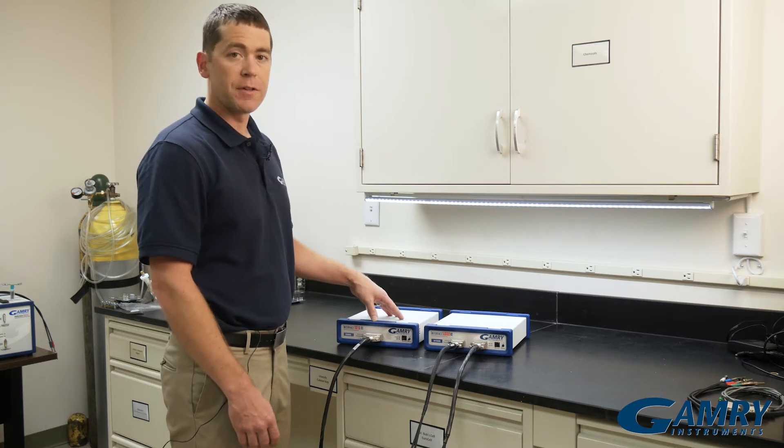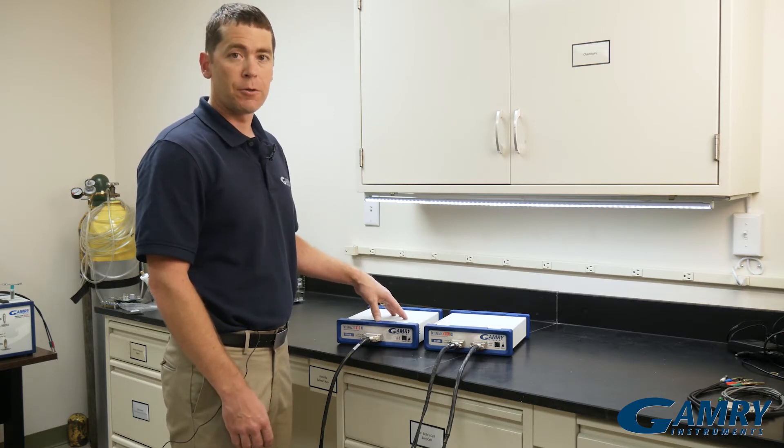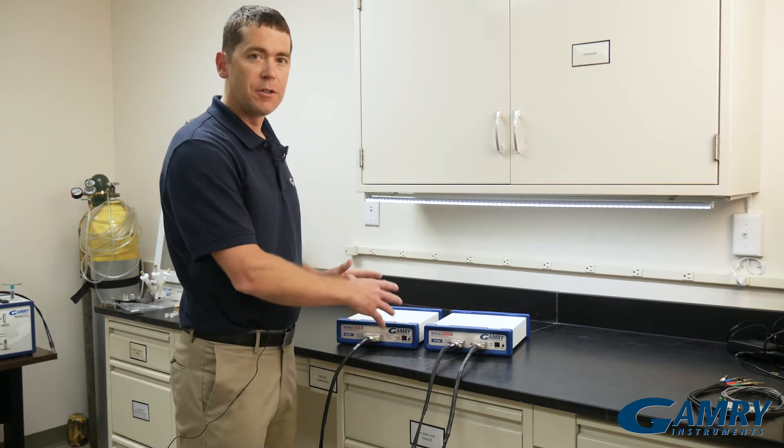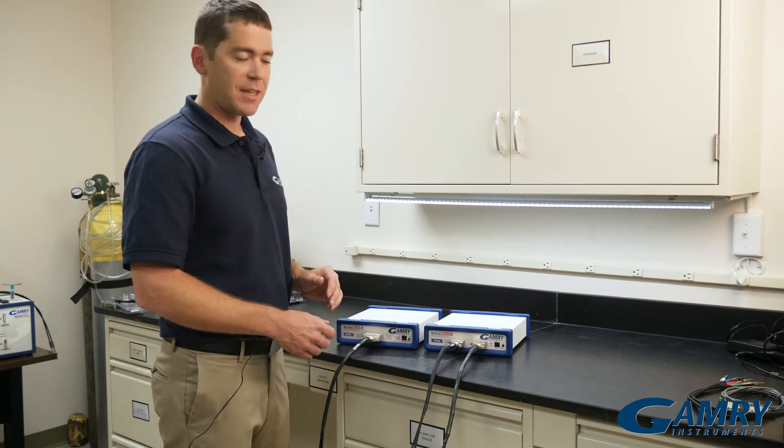I could also do this with two Interface 1000's — one of our older models — or two Interface 1010's, or two Interface 5000's. You can mix and match within potentiostat families.